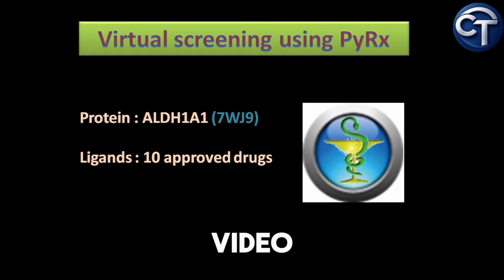In this video, I'm going to explain how to perform virtual screening using PyRx. PyRx is a software which uses AutoDock 4 and AutoDock Vina for molecular docking. But in case of AutoDock 4 or AutoDock Vina, the ligand molecule can be docked one at a time.